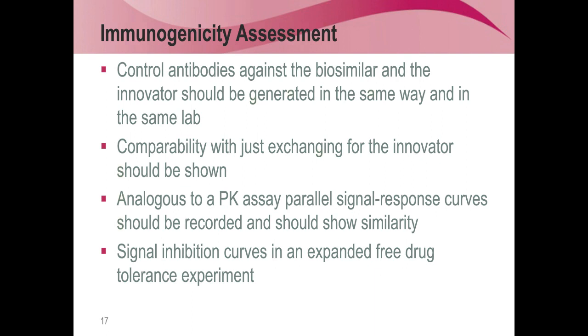So when we go ahead, we have these two antibodies in the lab, and we basically produce both assays, meaning we use functionalized biosimilar and functionalized innovator as a capture and detection reagent, and it essentially gives us something very similar to the PK assay. And then we're also doing another experiment, which I'll come to later.